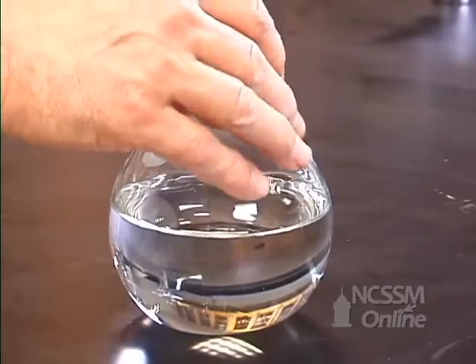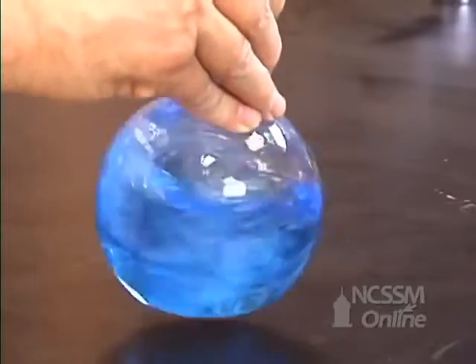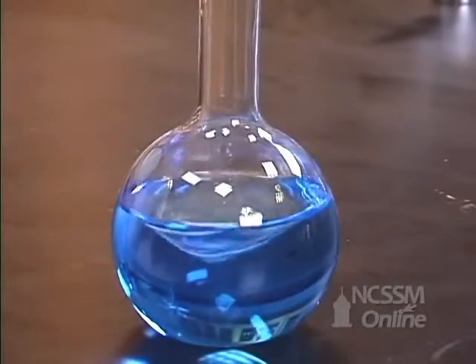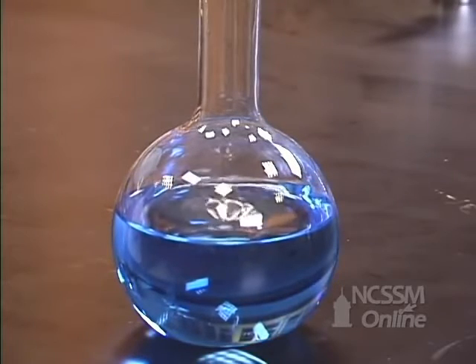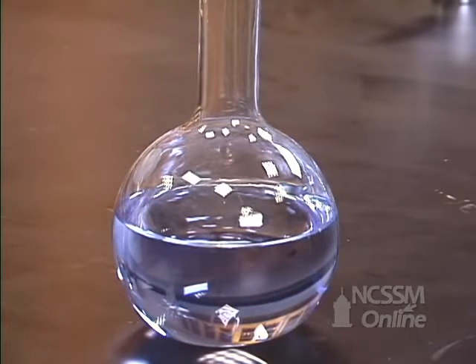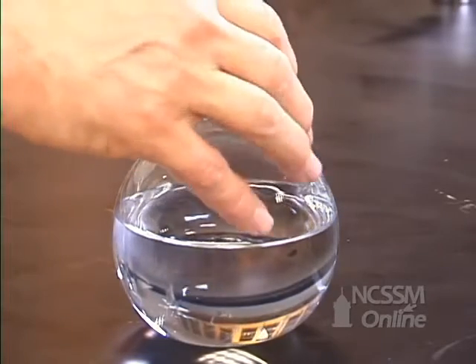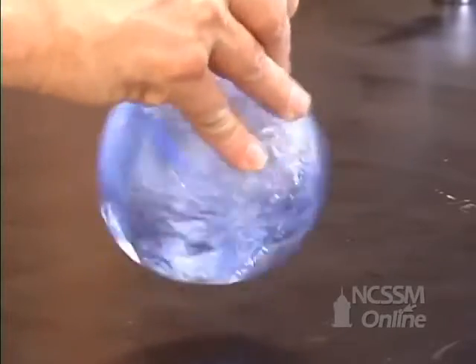I'm going to swirl the flask again, and let it stand. Swirl the flask, and let it stand.